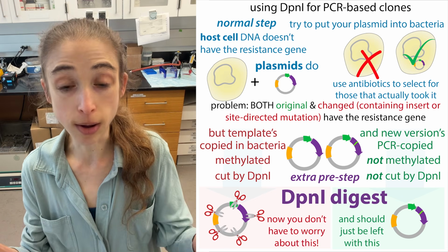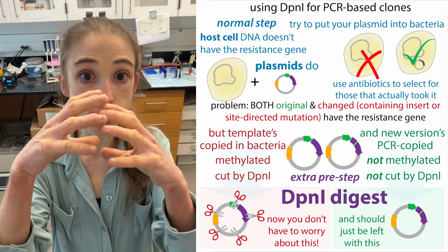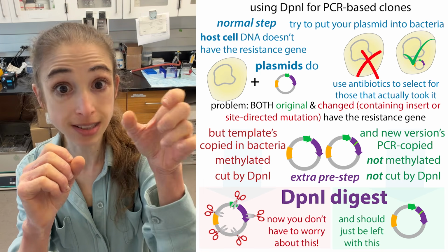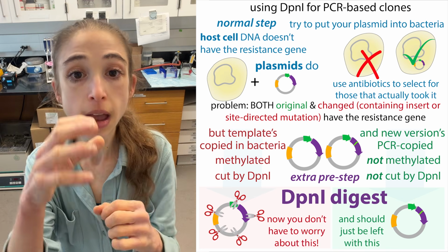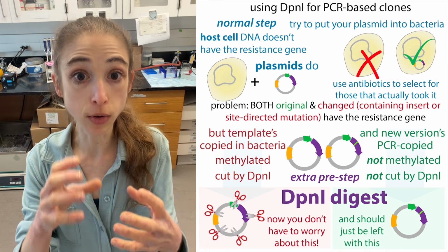And so why do you care about this? Well, if you go now and try to stick your mixture that has your mutated version, and a small amount, but still some amount, of your template, the original version, into bacteria, the bacteria are going to take in both versions.